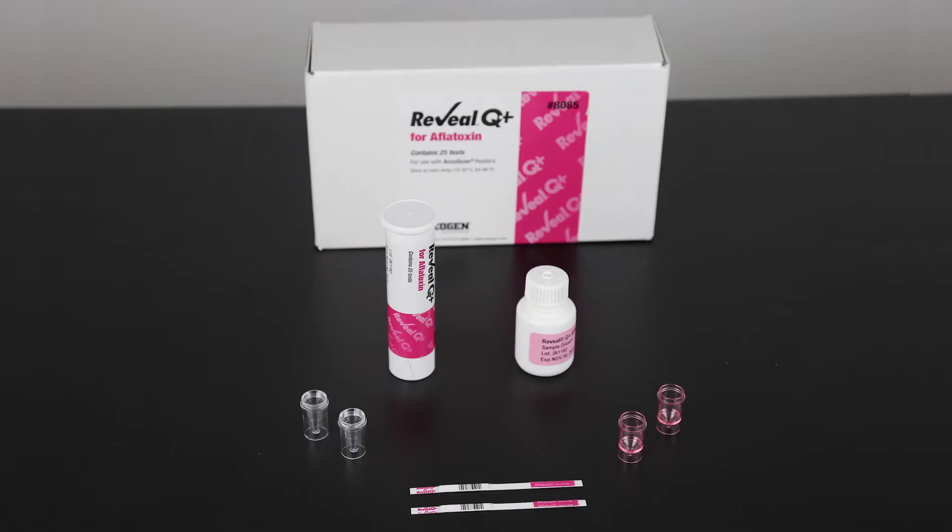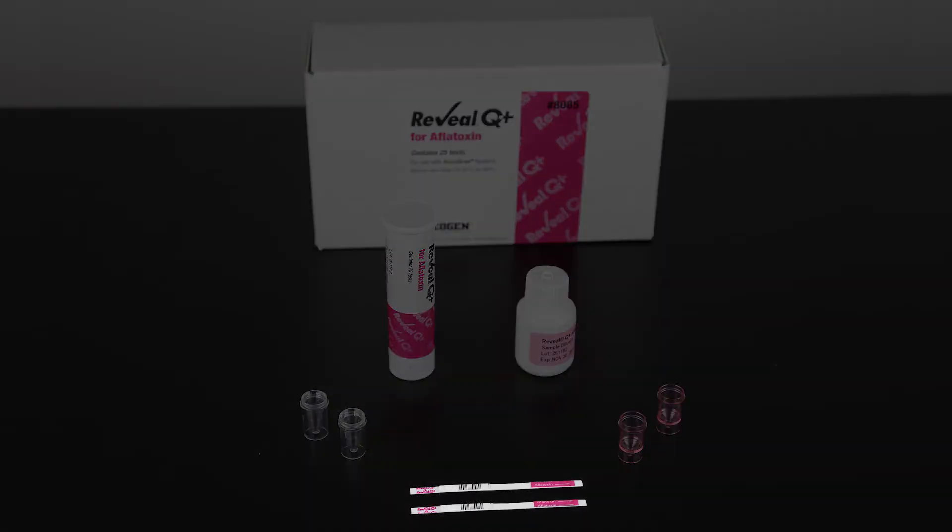Each kit contains supplies to test 25 samples. The kit includes test strips, clear sample cups, red dilution cups, and a bottle of sample diluent.